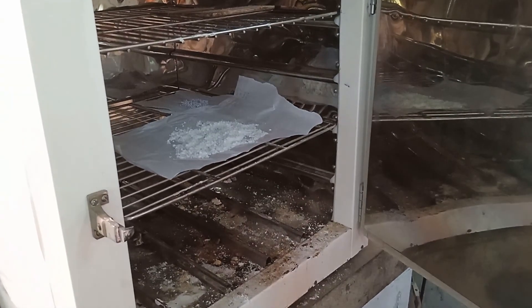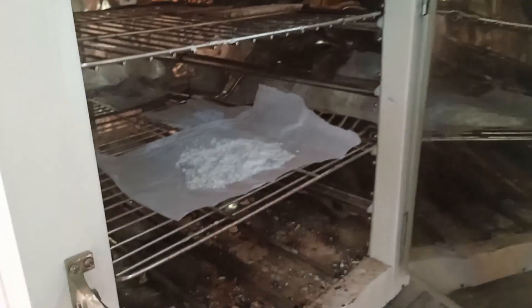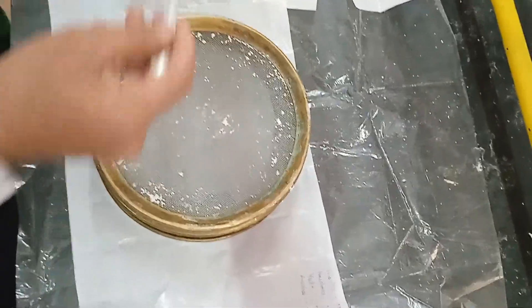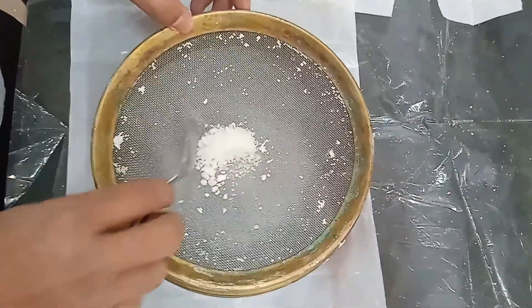The next step is the drying of the granules at 65 degrees centigrade for about one hour. Now the next step is the sifting of the dry granules through the 20 mesh sieve.